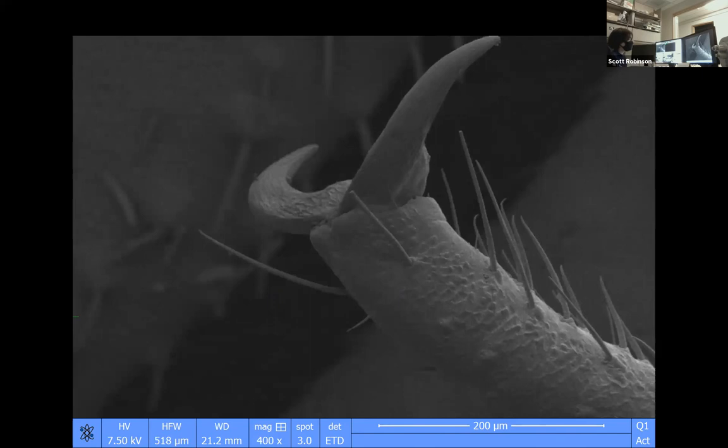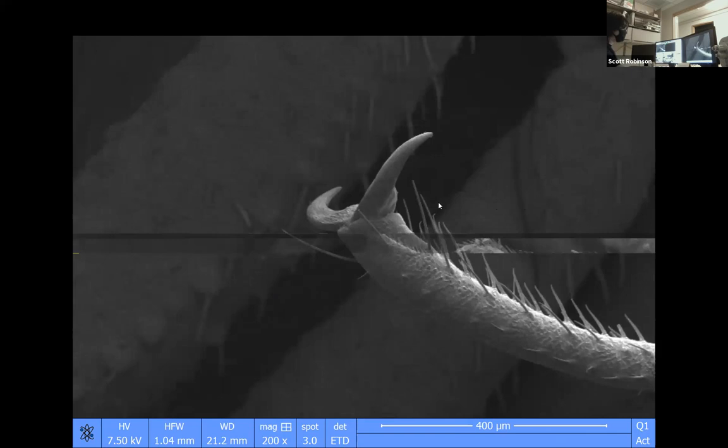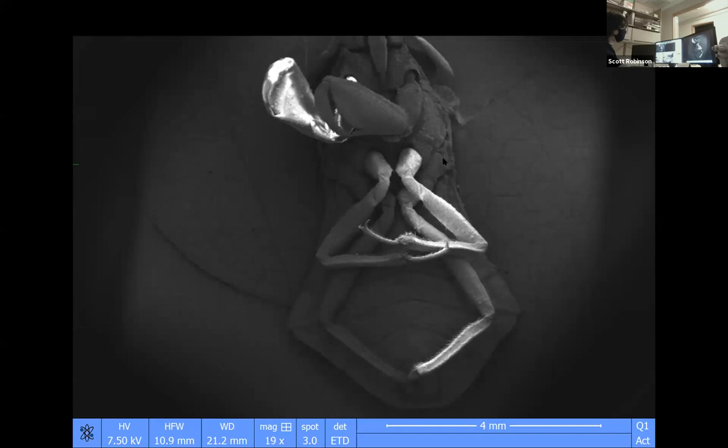Oh, look at that. Yeah, these are the tarsal claws of this insect, which it uses basically to grip the substrate that it's on. But I wanted to see if I got the hang of this now. I think I'm getting the hang of it.